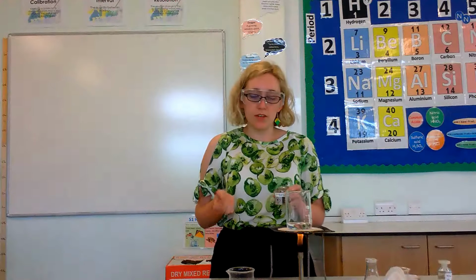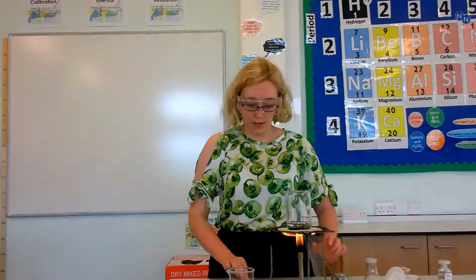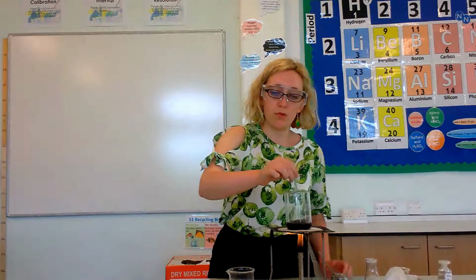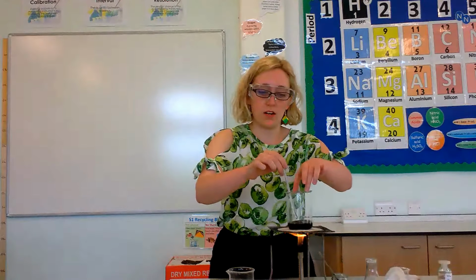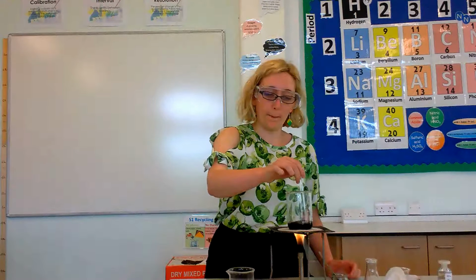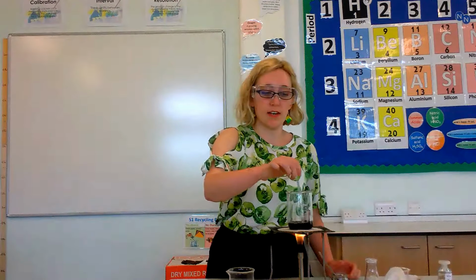While that's heating up, I can now start to put a couple of spatulas of copper oxide in. When you first put the copper oxide in, it will look black. It will look like you've got a black cloud in there. Give it a couple of stirs and the solution will start to go a bluey green colour when the acid has heated up enough. This is because the solution that will be formed is that colour. We keep stirring until it forms that nice blue colour, but that's not the colour we want to end up with.